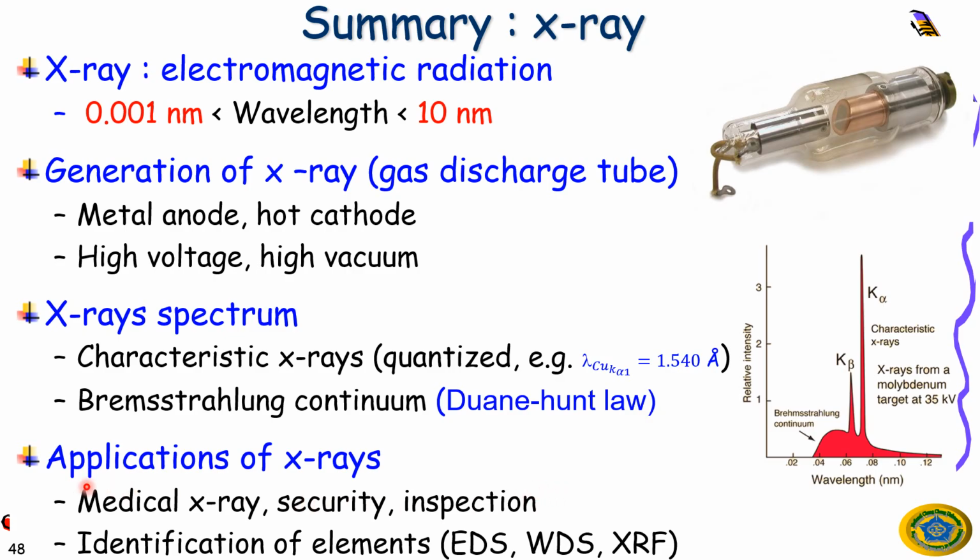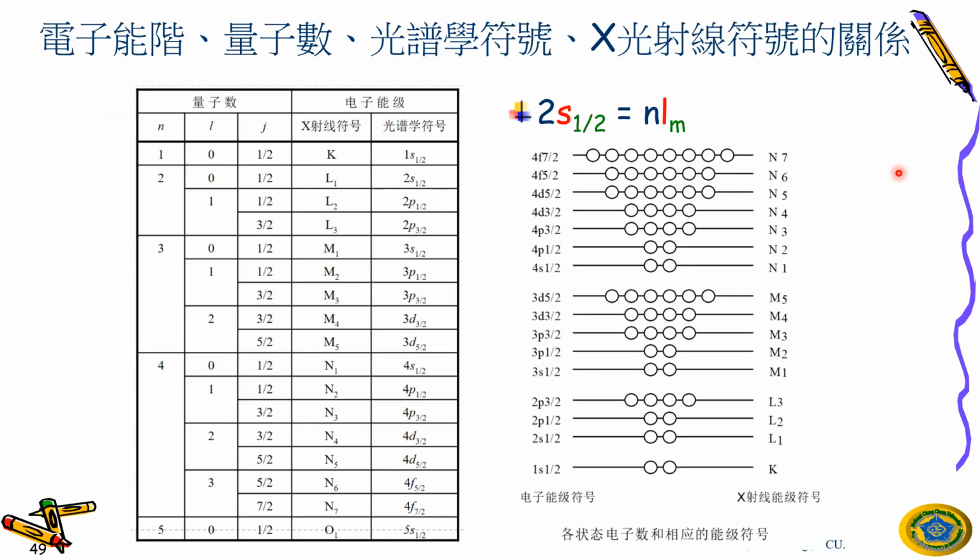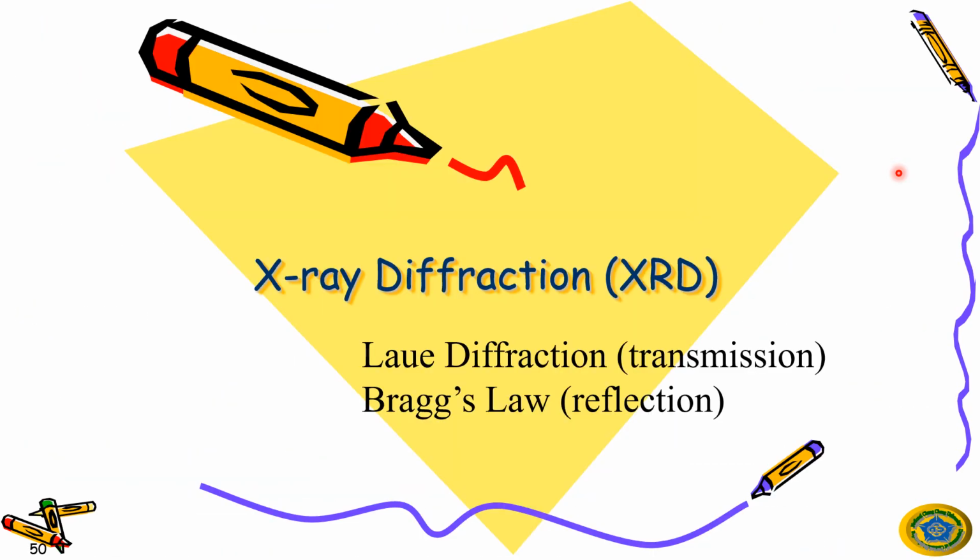However, for the scientific application, if you have an unknown material, you put the unknown material into a machine, and you will produce X-ray. For example, machines like EDX, WDS, XRF can identify the unknown materials you use. But it's only for the elements. You know that it can be aluminum oxide, but the peaks that come out are aluminum and oxygen, right? So that's what we learned last week on Wednesday.